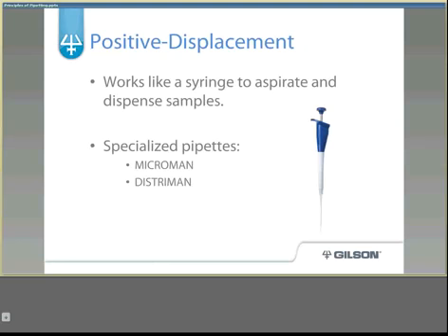Positive displacement pipettes work like a syringe to aspirate and dispense samples. These are more specialized pipettes designed to handle problem samples. Examples include the Microman and the Distriman.